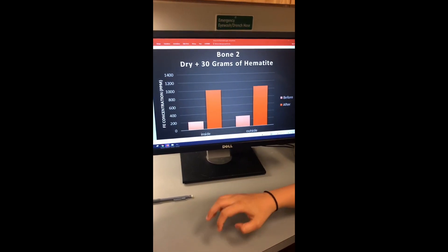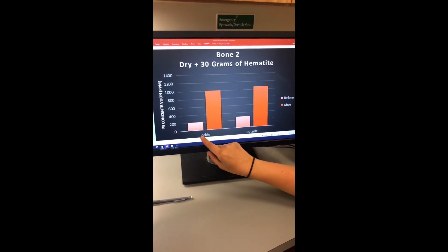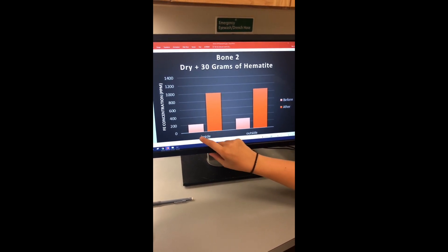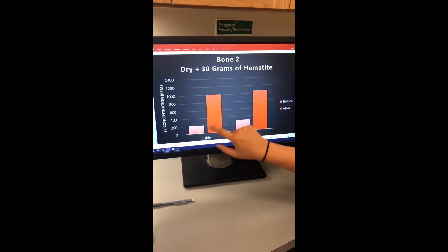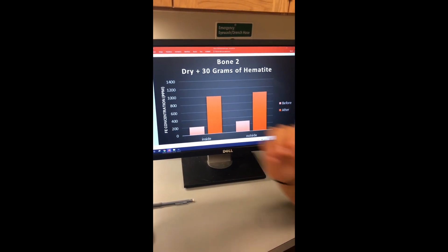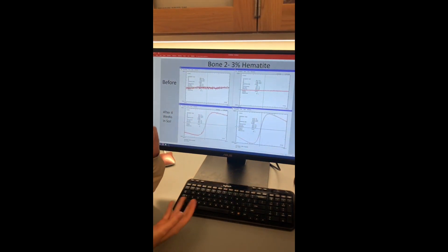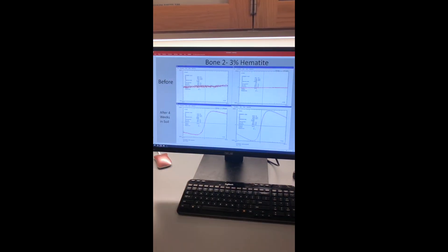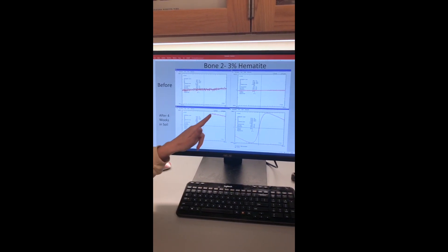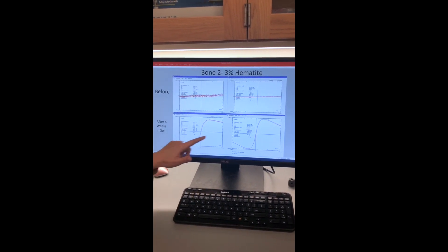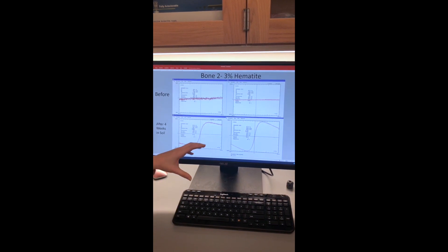Here are the PXRF results for bone 2. Bone 2 was in dry conditions with 30 grams or 3% of hematite added to it. We can see clearly that the iron content increased in that four week period both inside and outside the bone. Now, let's compare that to our AGM results. For the AGM with bone 2, we see that before this four week period, there are really no measurable trace amounts of hematite. However, after the four weeks, we actually see a hysteresis loop forming for both of them. This means that the AGM is indeed picking up hematite in both of these samples, and that leaching has occurred.